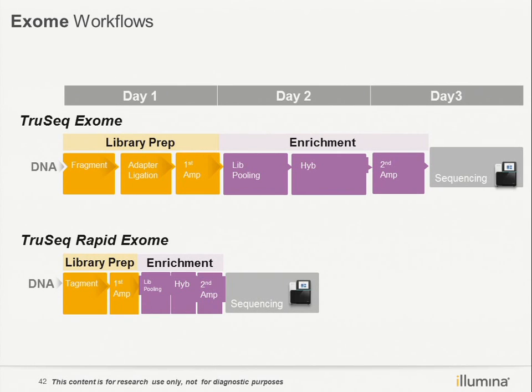And for the second option, you can finish the library preparation within 1 day, followed by the sequencing on the second day. So you can finish the whole workflow in maybe 2 to 2.5 days. So it's a bit faster.